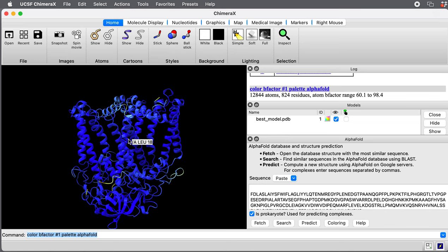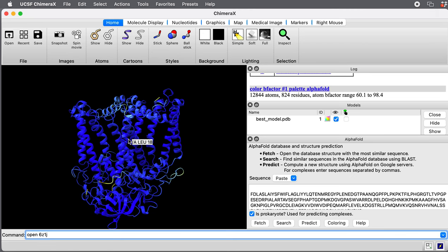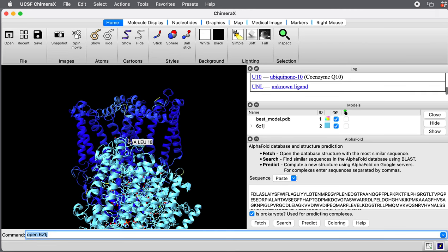Let's take a look at an experimental structure of this same complex. There's a PDB file determined by x-ray crystallography. That's 6Z1J. I'll say open 6Z1J.